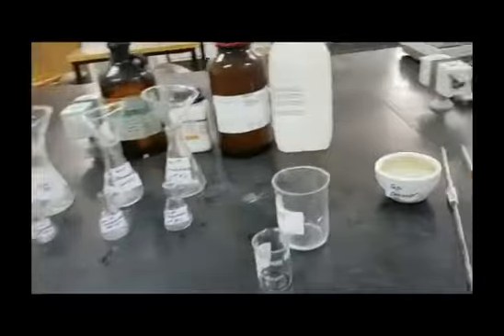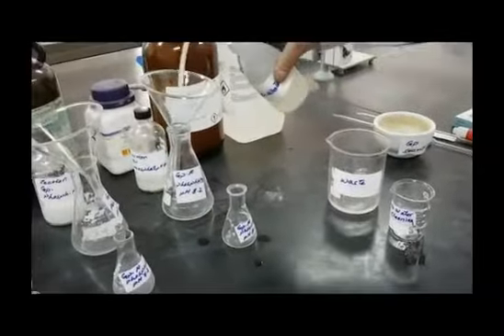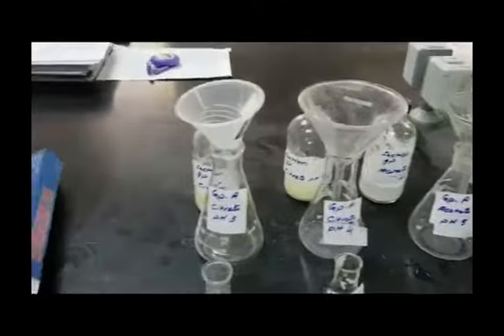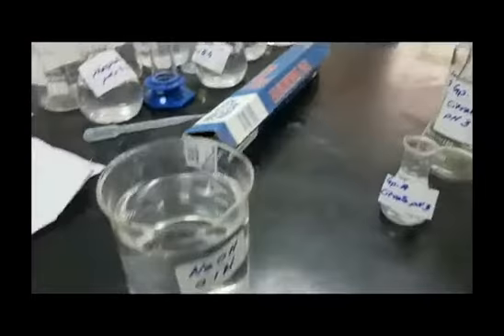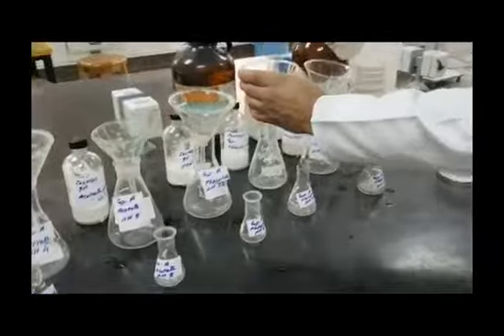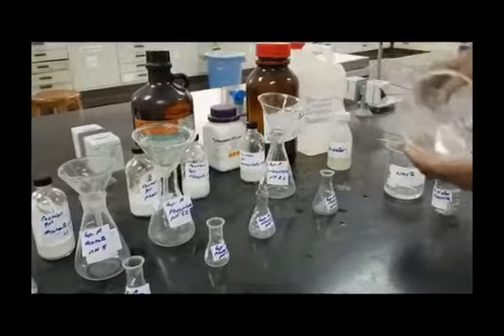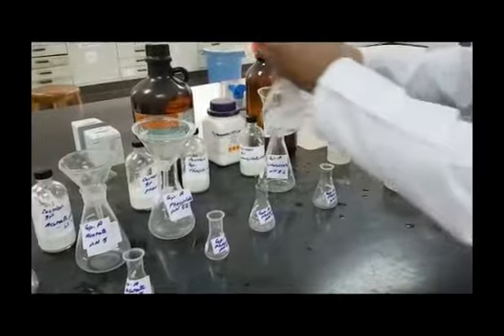First, remove your bottles from the shaker and place them in a well-organized working area. Start with rinsing the filtration assembly. Here we are using a gravity filtration. Then we need a funnel and Erlenmeyer flask together with a filter paper. Rinse everything using distilled water at the beginning.